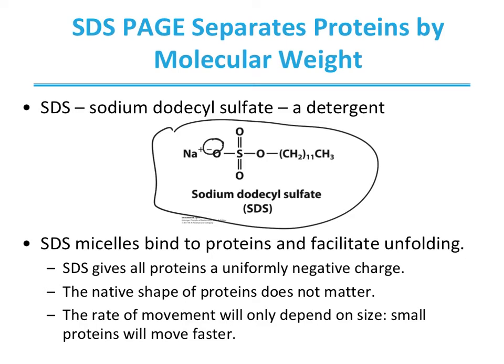Therefore, the separation is going to be based purely on the mass. Therefore, this method is particularly useful in determining the mass of proteins. And smaller proteins will move faster, larger proteins will move slower.